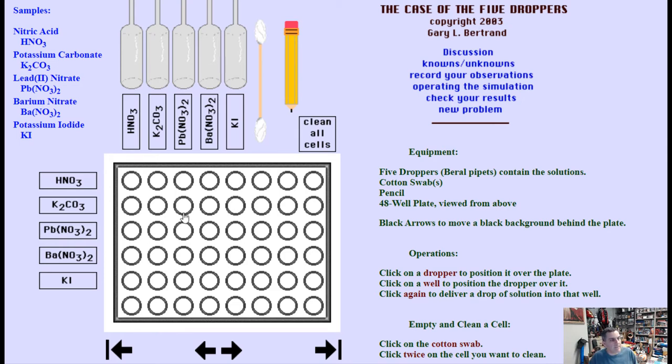What you've got here is a well plate, essentially a bunch of really short test tubes smooshed together. You're looking from the top down at these little areas where you can put drops of different chemicals and see how they react. The nice thing is they're really well organized so you can make a little matrix, a little grid, and label things with columns and rows.